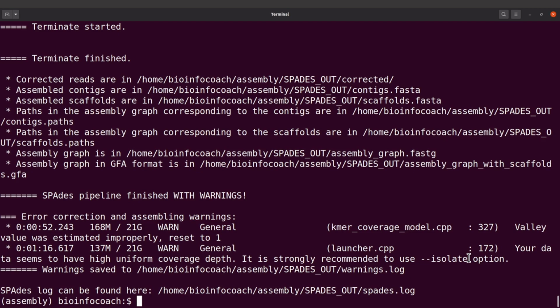One such tool is Quast, so you can use that to compare both assemblies and then choose the one which is of higher quality. That's what I recommend you do. But for this tutorial, we are going to use what we have. We are not going to rerun SPAdes. But if you have your own data set, it's recommended that you take into consideration whatever SPAdes recommends for you to use.